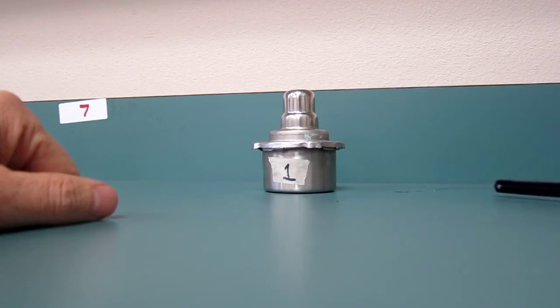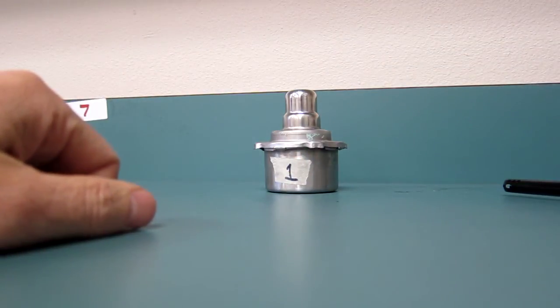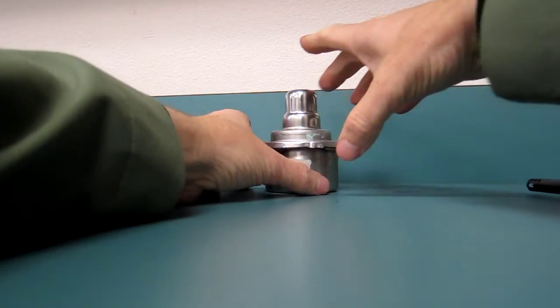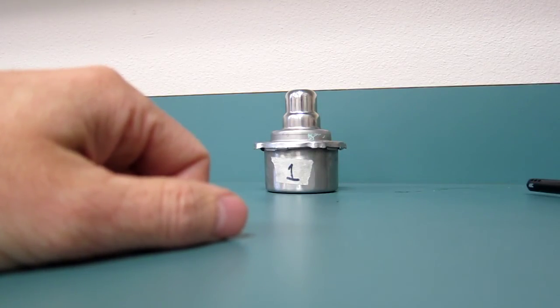What happens when you run out of alcohol? You go up to the front of the room with the lid back on, everything secure. You bring it to me and I can refill it for you up there. You just take the lid off for me, nice and still, okay, on a platform. Take the lid off for me at the front when I'm there, and I'll fill it back up. You put the lid back on and go back to your seat.